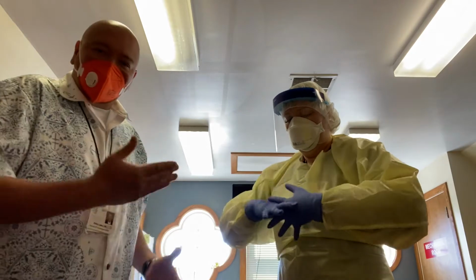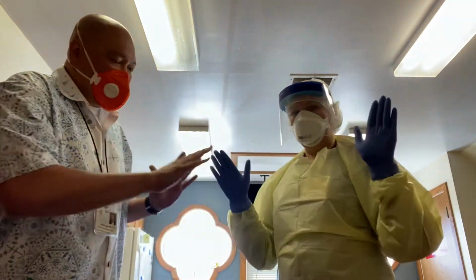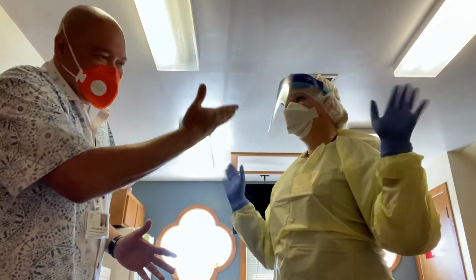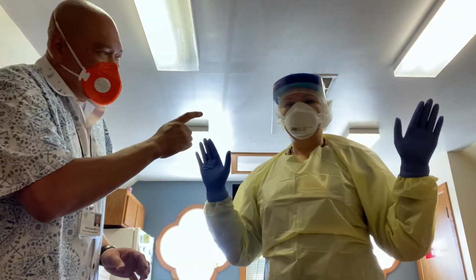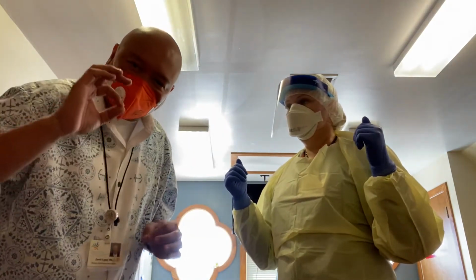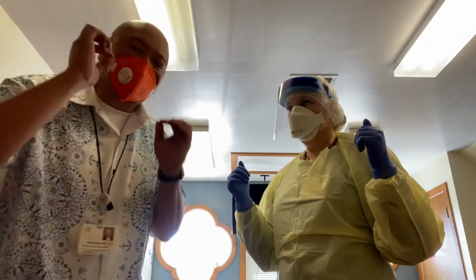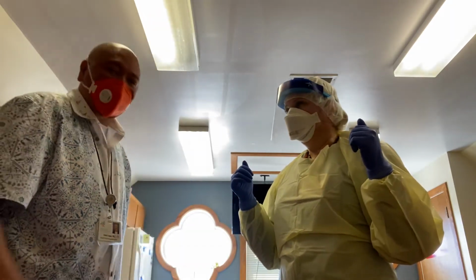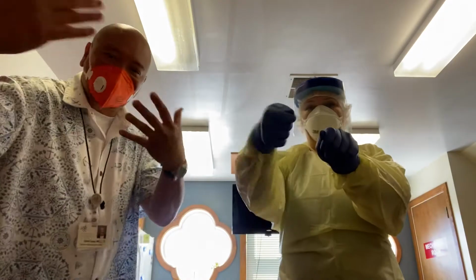Okay, that completes the process of the donning of our PPEs. As you can see, she is fully sealed, ready to go. We try to make sure that everything is fitted well and there's nothing loose, especially on the N95 mask. Then she goes off and proceeds to do the testing.